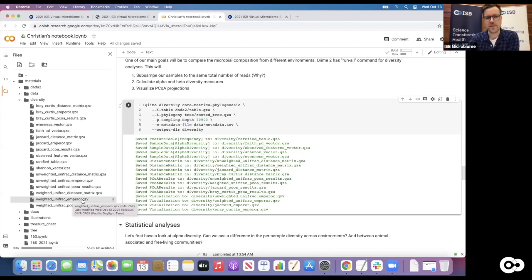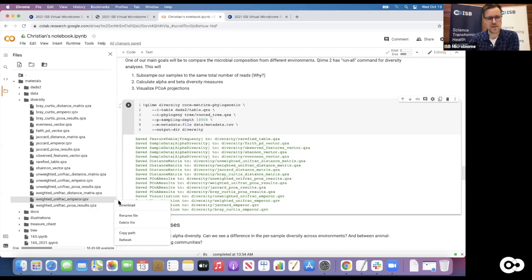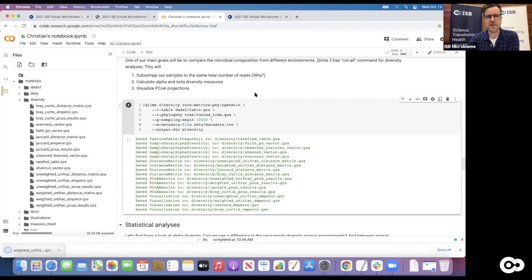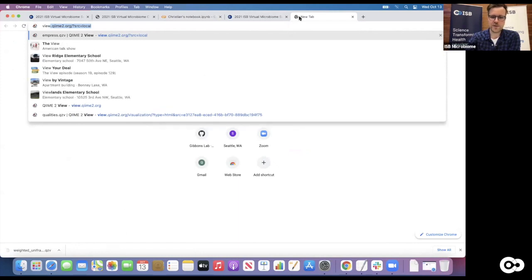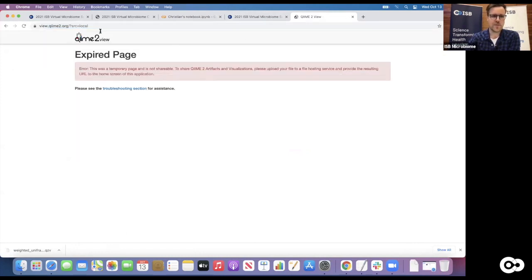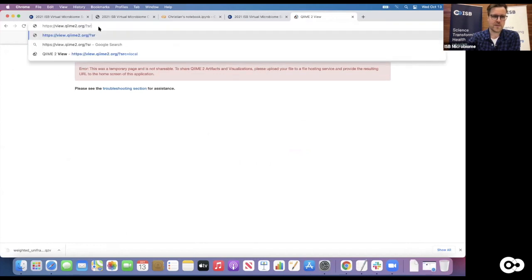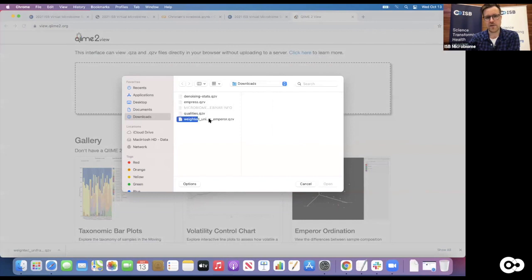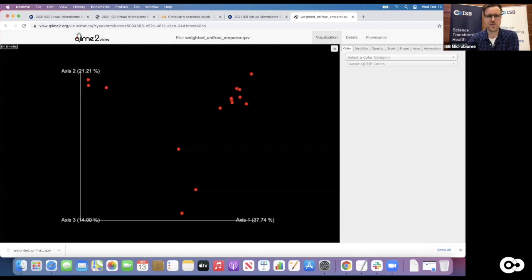That uses everything we have done - it takes phylogenetic similarity into account, whether sequences are very similar or different, it takes the abundances between samples into account, and then the Emperor plugin in QIIME 2 creates those visualizations. Let's download that by clicking the three little dots next to it, clicking download, and then opening it at view.qiime2.org. We open the weighted UniFrac emperor QZV file and it looks pretty nifty - we get that projection, a three-dimensional plot.